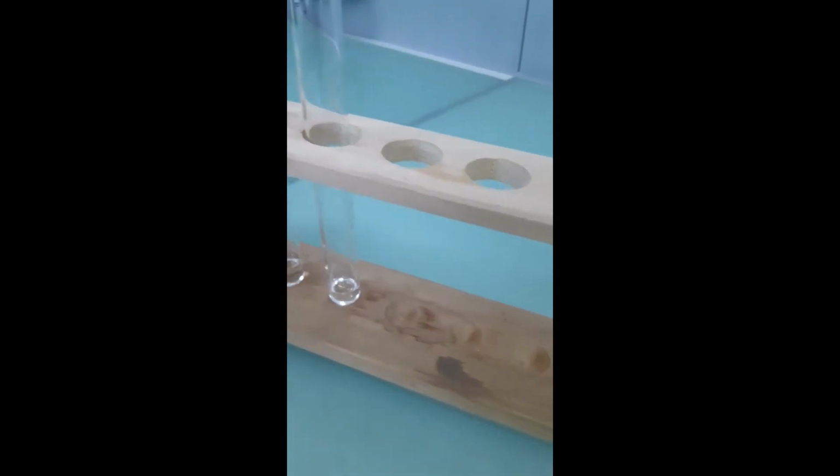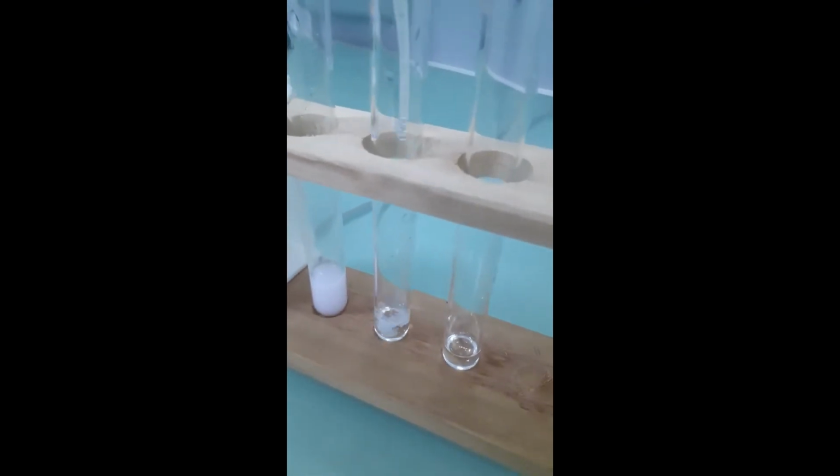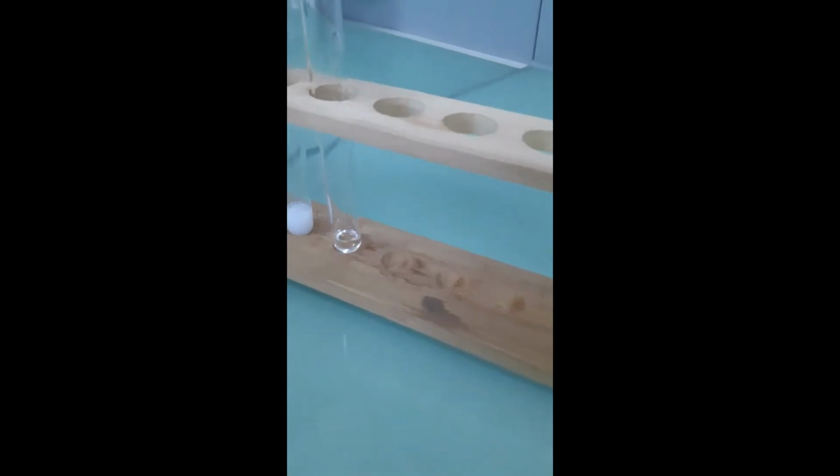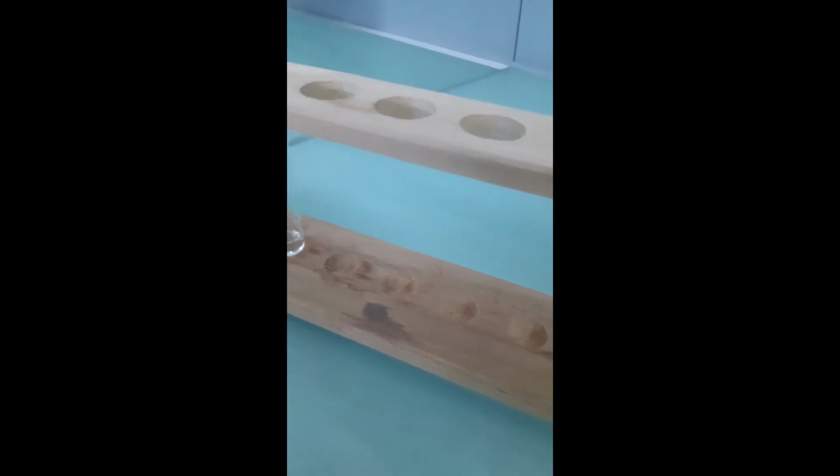Next, we will do the sulfite. That's the sulfite. And the third test tube is the sulfate.